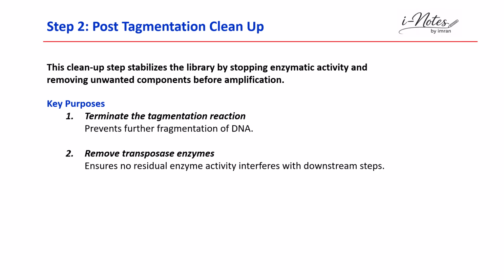If I tell you the methodology, generally once the tagmentation is over, you take the reaction from the thermal cycler and you have to add the tagmentation stop buffer which is provided in the commercially available kit, and then again you have to incubate the reaction for the advised duration at the advised temperature, and then proceed with the washing.